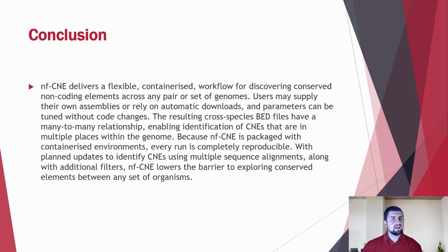And in conclusion, nf-CNE delivers a flexible, containerized workflow for discovering conserved non-coding elements across any pair or set of genomes. Users may supply their own assemblies or rely on automatic downloads, and parameters can be tuned without any code changes. The resulting cross-species bed files have a many-to-many relationship, enabling identification of CNEs that are in multiple places within the genome. Because nf-CNE is packaged with containerized environments, every run is completely reproducible, with planned updates to include CNEs using multiple sequence alignments along with additional filters. nf-CNE lowers the barrier to exploring conserved elements between any set of organisms.